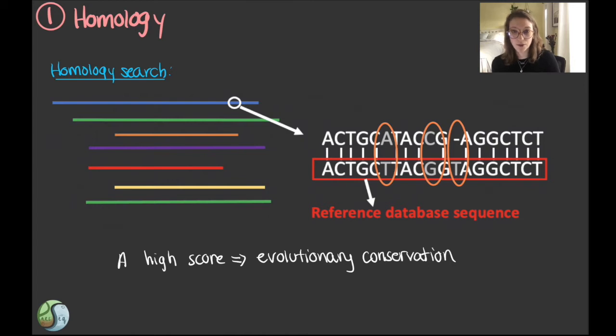Take this sequence of nucleotides, for example. Let's say that you know this is a known sequence of an ARG. Your Galaxy workflow will detect when a homologous match appears in the FASTA file you inputted and outputs that sequence as a potential ARG in your sample. Think of this process like a needle in a haystack, like we talked about last video.